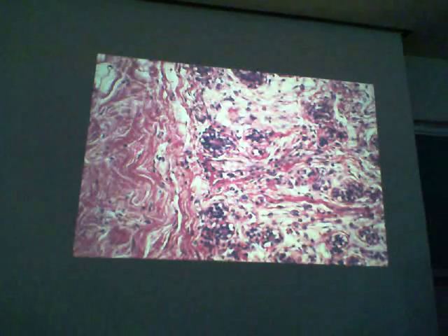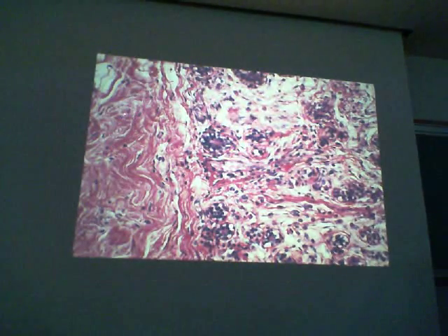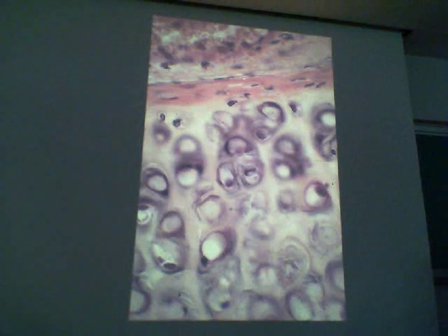And the same thing, this is overstained with H&E. There's dense irregular, and here is loose connective tissue. What are those fibers? Collagen. Collagen type 1 to be specific. And this tissue, what is this? Hyaline cartilage. And out here we have a layer, that layer would be what? Perichondrium.